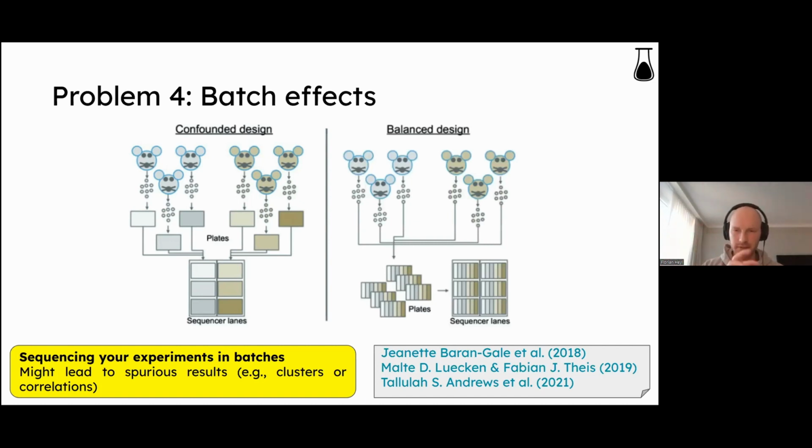So basically predicting the batch effects and removing these batch effects from your data. What you quite often, so I will show you a picture. What might happen is that you see spurious clusters based on these batch effects. And when you do a batch removal, then your samples hopefully should mix very uniformly and not cluster individually.